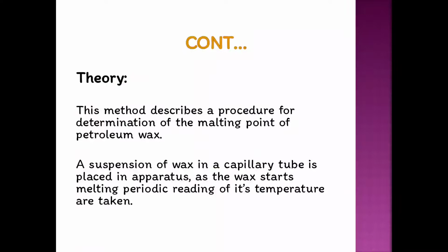So what is the theory behind this experiment? This method describes a procedure for determination of the melting point of petroleum wax. So a suspension of wax in a capillary tube is placed in apparatus. As the wax starts melting, periodic readings of its temperature are taken.